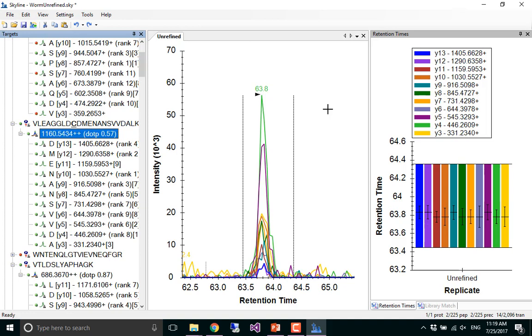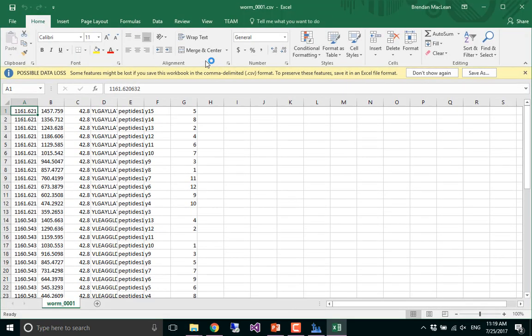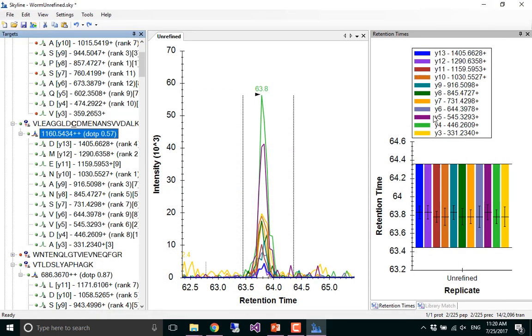No, Skyline won't split them up. Skyline will make sure that they're all whole. So it's doing that for you. We said there's a 59 transition limit, but if you look in them, they're not all exactly 59. So it's like, oh, can't fit that, and it does that for scheduled methods as well, which is a lot harder problem for scheduled methods.